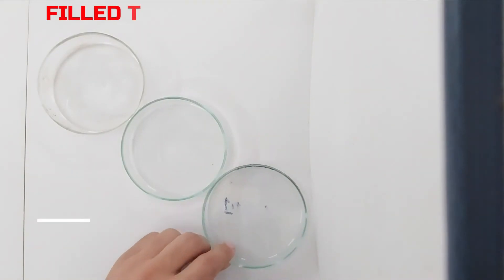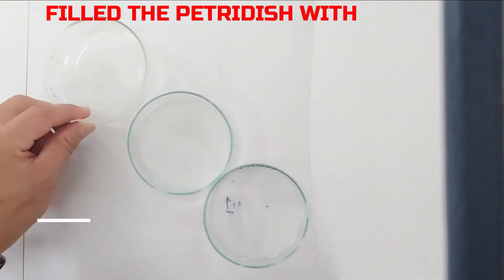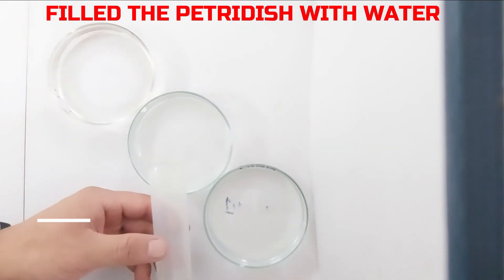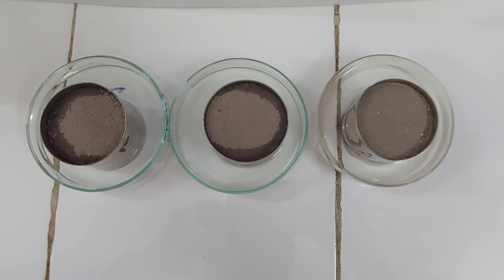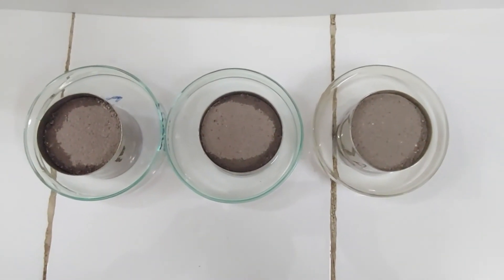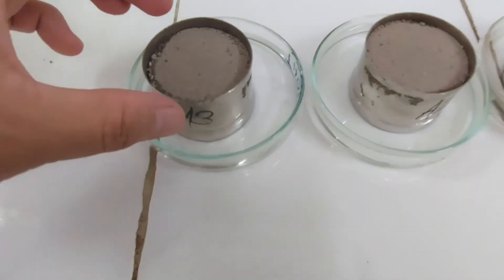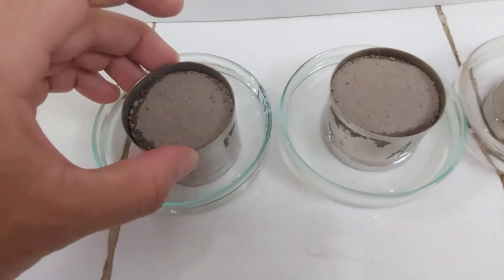Next, take the petri dish — select one having a maximum height — and fill it with water. Place the Keen Box filled with soil into the petri dish filled with water. After this, tilt the Keen Box several times and then leave it overnight.